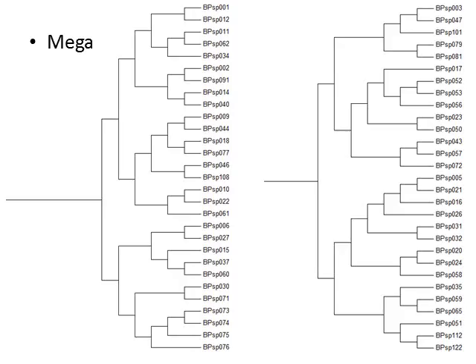ClustalX is a Windows interface for the ClustalW multiple sequence alignment program. It provides an integrated environment for performing multiple sequence and profile alignments and analyzing the results. The sequence alignment is displayed in a window on the screen. A versatile coloring scheme has been incorporated, allowing you to highlight conserved features in the alignment.